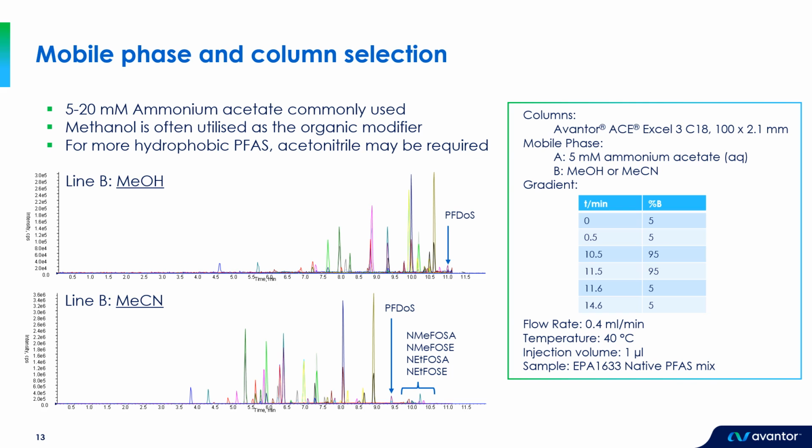If we now switch our attention to the stationary phase that we're going to use for our gradient separation, we discussed earlier that we're going to use reverse phase chromatography, and therefore the C18 stationary phase has become routinely used for many PFAS applications. One of the challenges of analyzing PFAS by reverse phase is that, as we saw earlier, a lot of the short chain PFAS have often very negative log D values, and so obtaining good retention of those short chain compounds on a reverse phase column can be rather challenging.